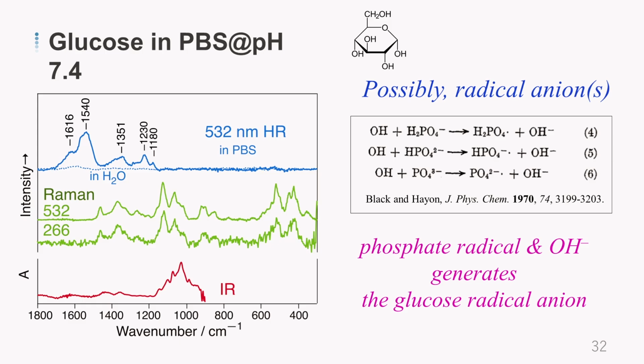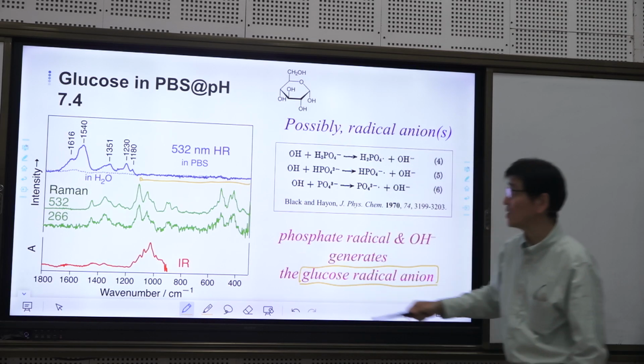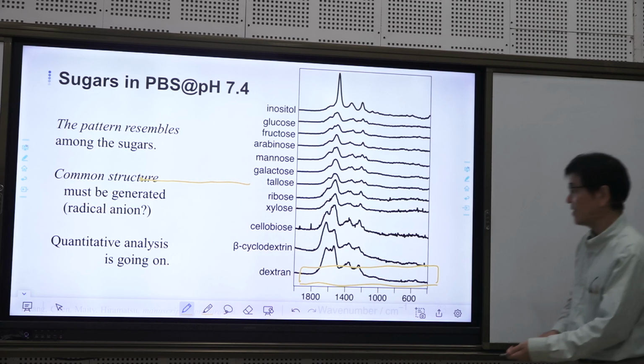It's because the double resonance effect enabled the extreme enhancement of the hyper-Raman signal. So the intensity of this species became much larger than the remaining species. That is the explanation at present. And this is a kind of recent progress.